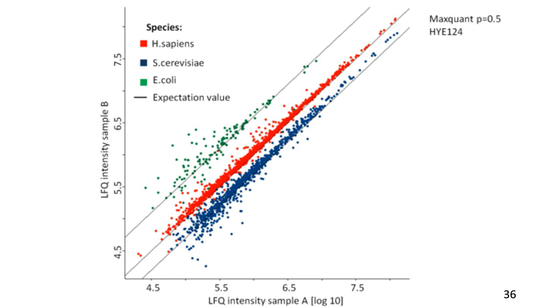We also have isobaric labeling working already in the version that is released.